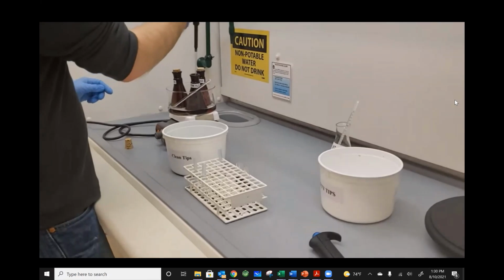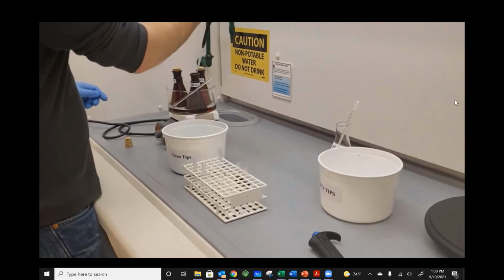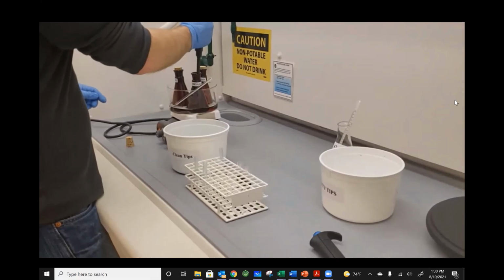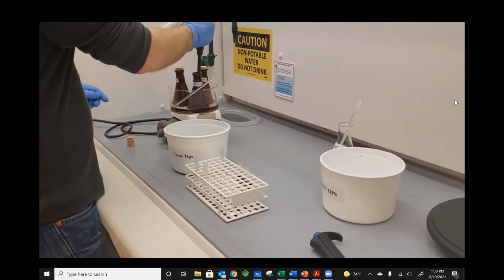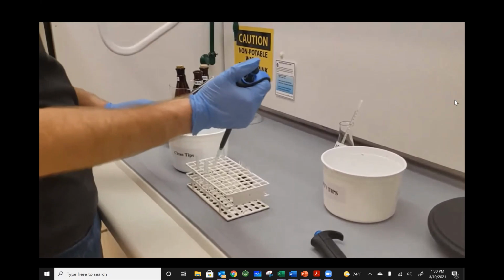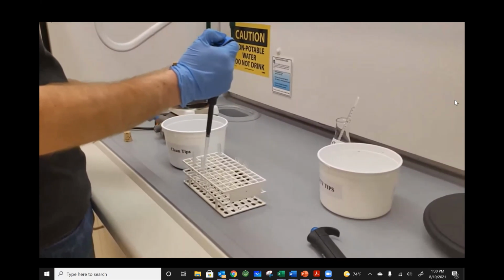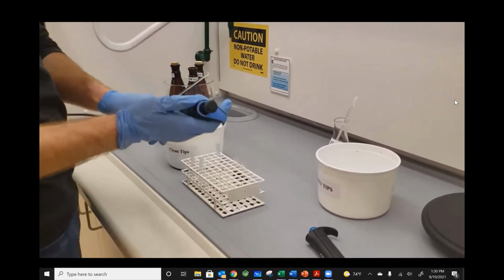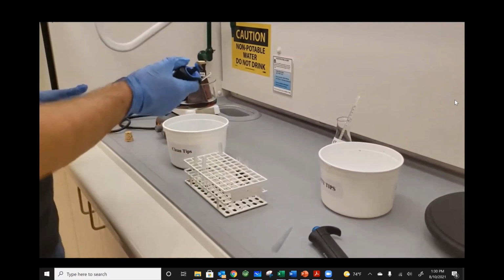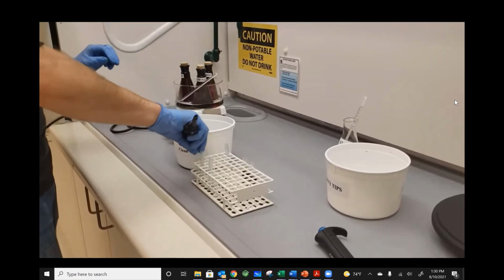I have to work quickly because I do not want much temperature change to occur outside of the unit. So that is another source of error, is that as I am transferring these solutions to this test tube, the temperature of the reaction chamber will be changing.